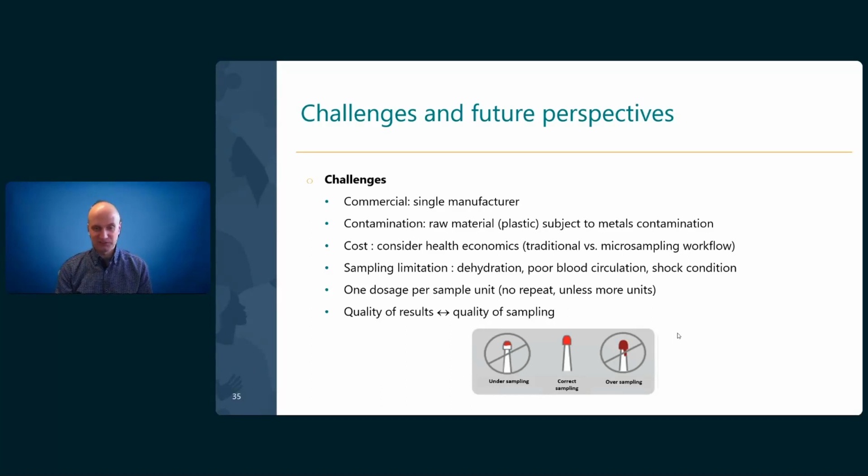You have to follow the instructions provided by the company. They come with the kits, so all the kits have this sampling procedure included. You have to avoid oversampling or undersampling, because this will have a huge impact on the results, obviously by overestimating or underestimating the results.